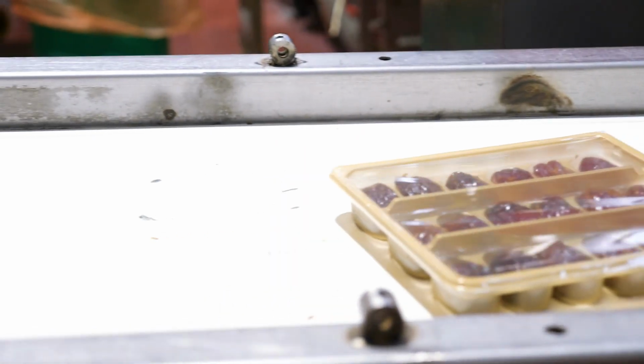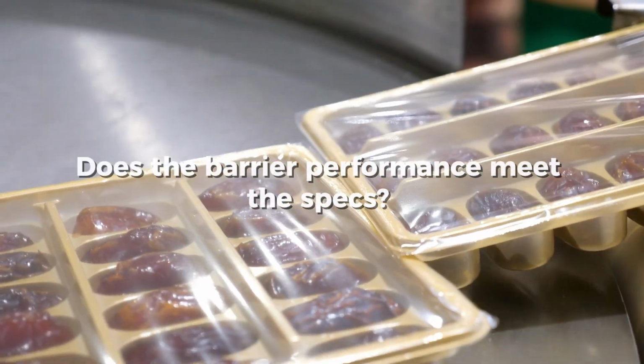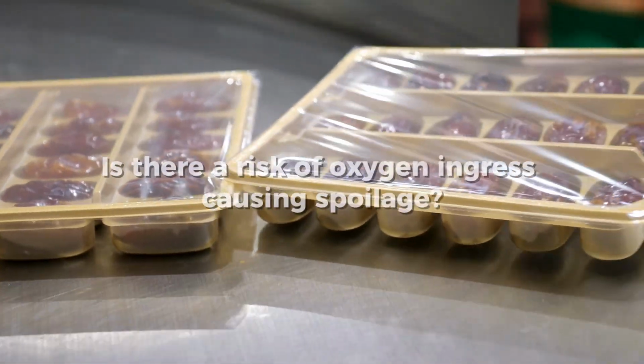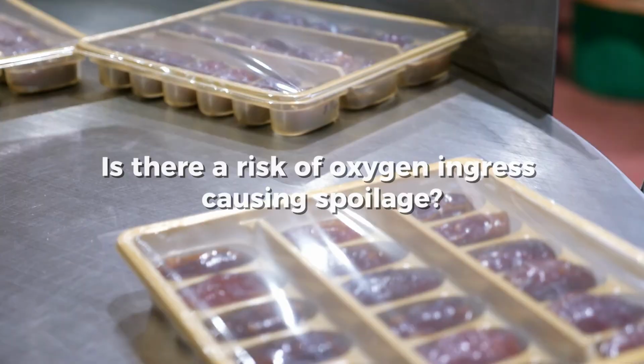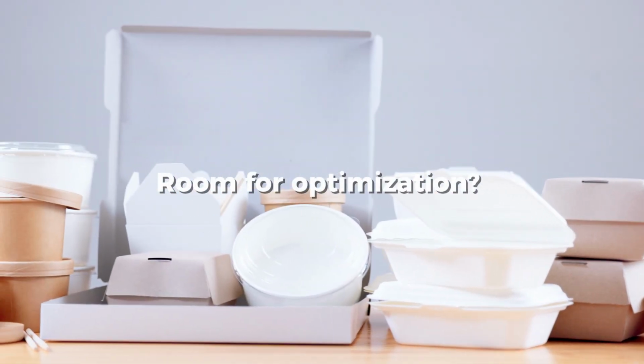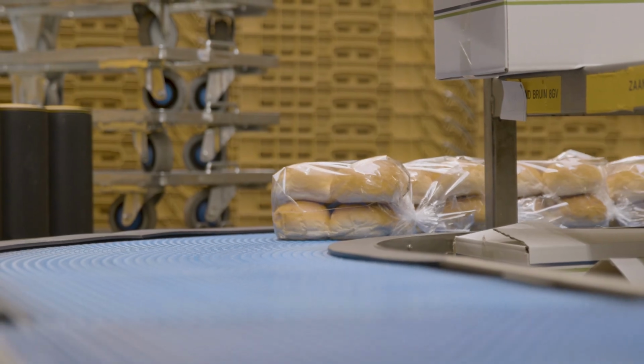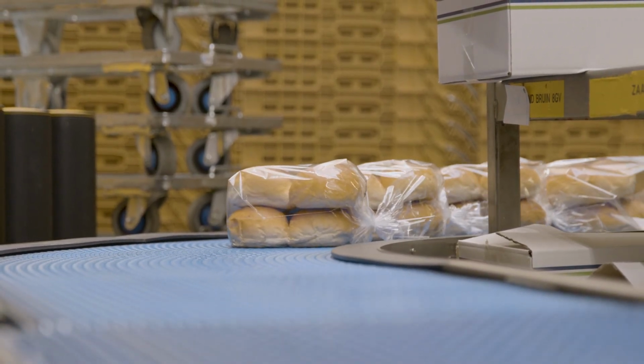If you supply packaging to a brand or food manufacturer, you need to know: does the barrier meet the specification? Is there a risk of oxygen ingress causing spoilage? And is there room for optimization, either reducing barrier to lower costs if storage conditions permit, or increasing it when shelf life performance is insufficient?